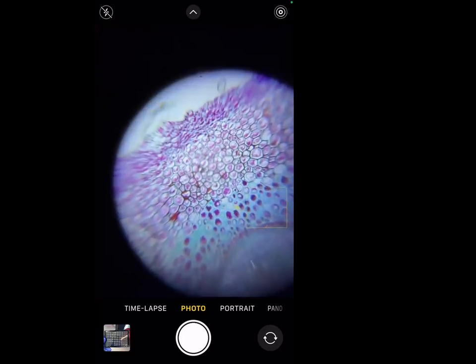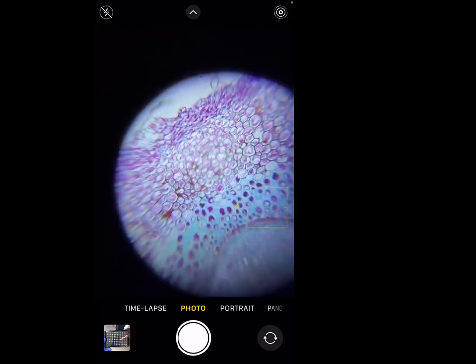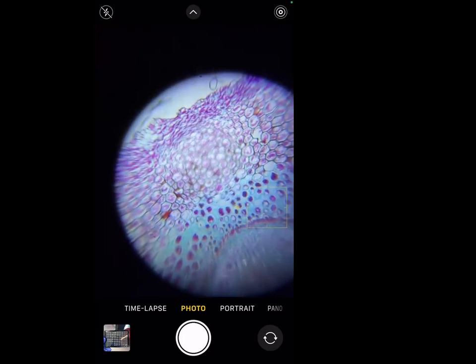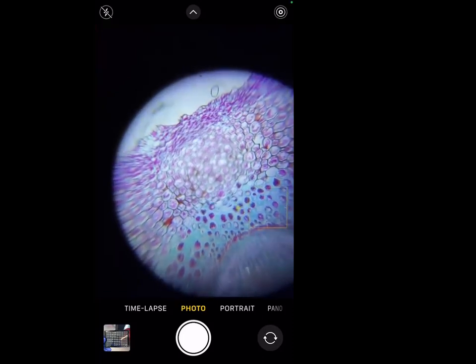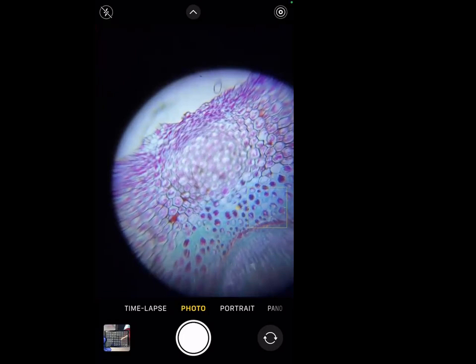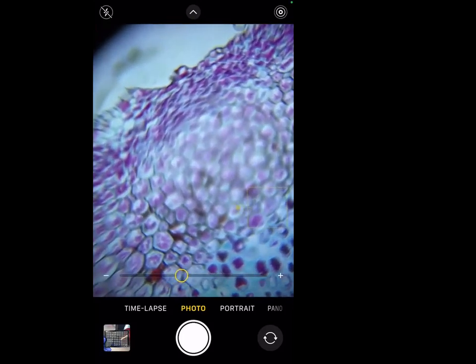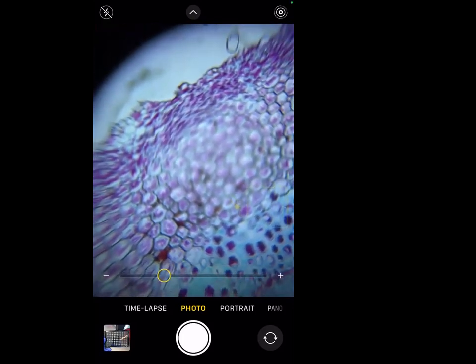Okay. And I can move out of the center focus, and I can see things adjacent to the cells in the center. So this gives you the opportunity to take an image. Right now, you can zoom in with your fingers on your cell phone. That's the digital zoom we are talking about. And then you can snap a picture. That's easy.